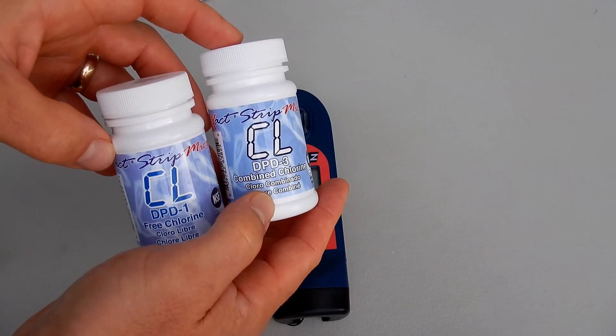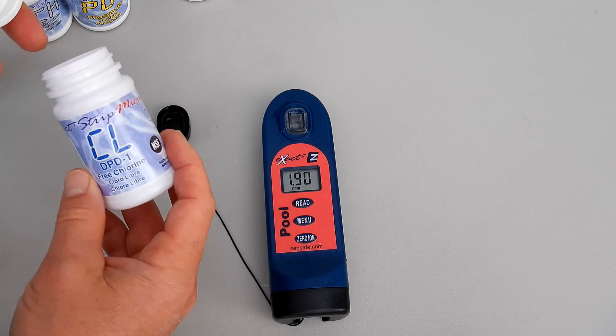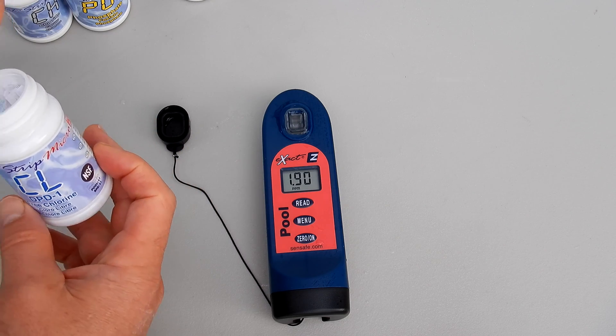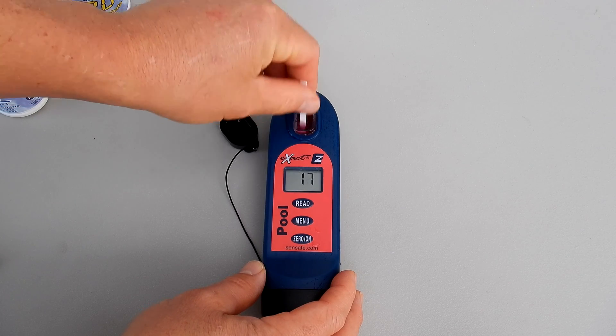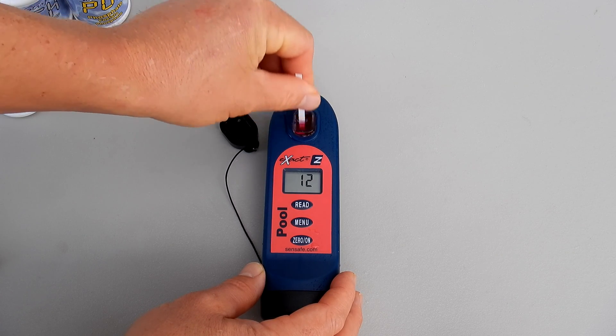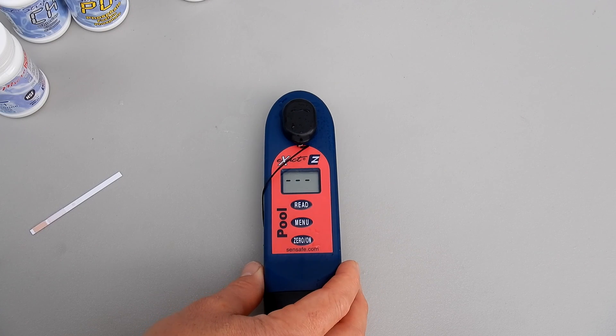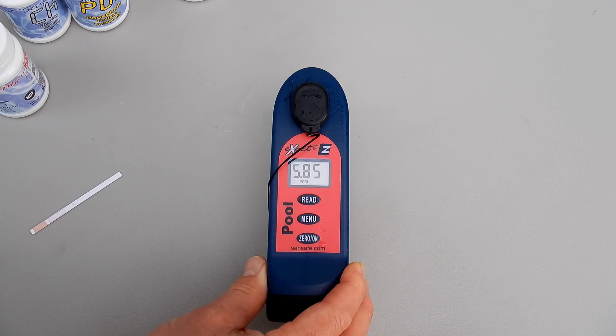The really nice thing about using the Pool EXACT EZ Photometer is that the testing is done with these test strips, making it very easy. These EXACT Strip Micros are specially formulated with the reagent on them so you get an exact reading. The fact that the reagents are pre-measured on the strip eliminates a lot of user error, so you're going to know that the results from the readings are going to be highly accurate.